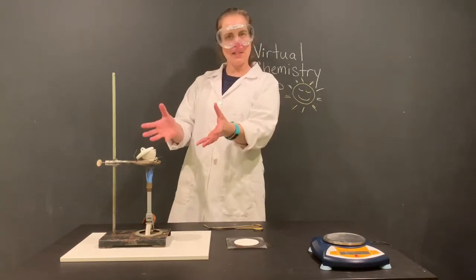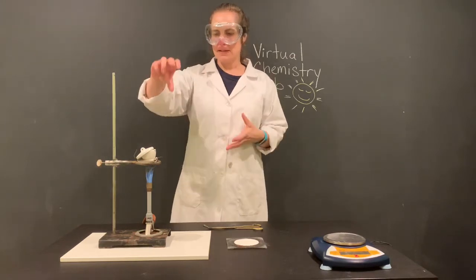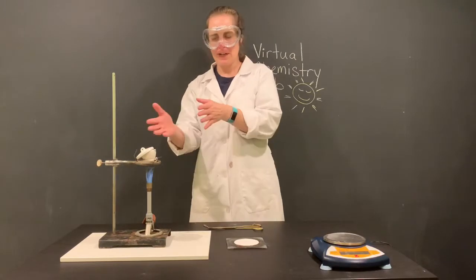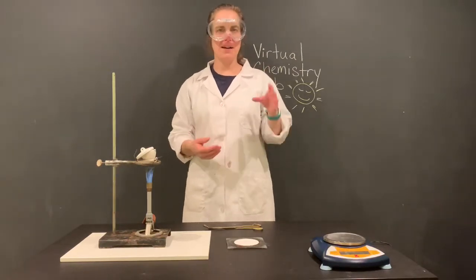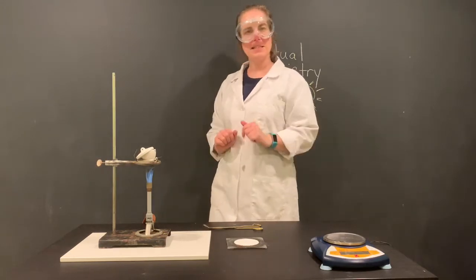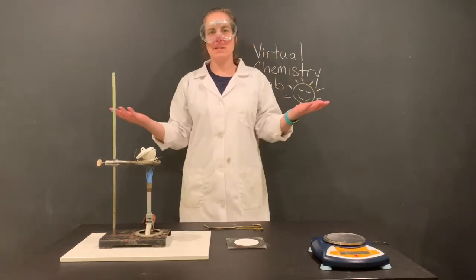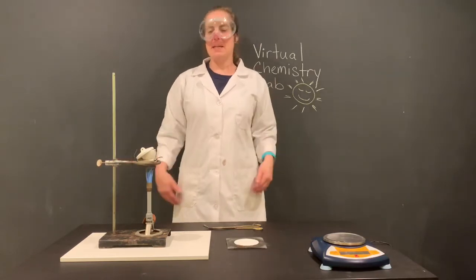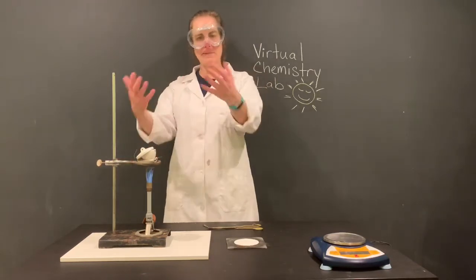So often because of the way it looks, students sort of touch it by just trying to move it gently just because they're trying to get it in the right position while it's already hot, and then they melt their fingers. So don't ever do that. We're going to let this heat up for about 10 minutes, and while it's heating, of course, we're not going anywhere because we have an open flame and we have an experiment going.